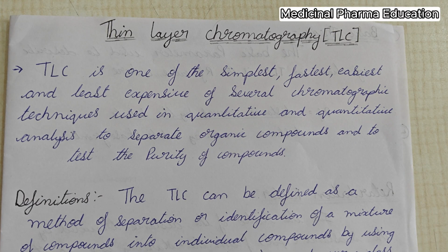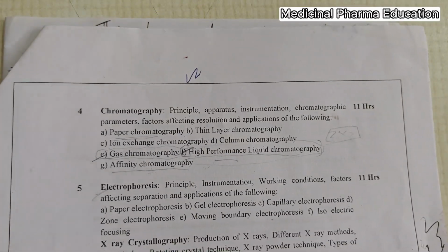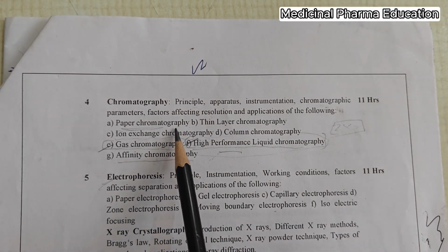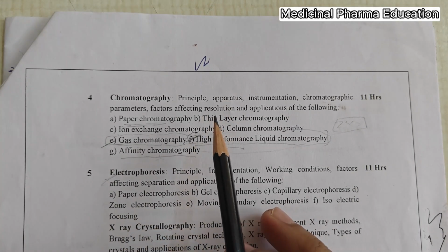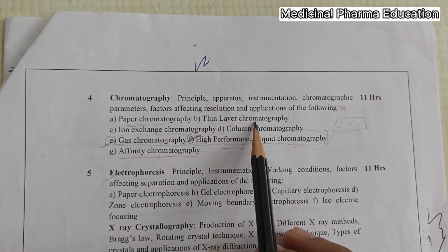In the previous class, we discussed paper chromatography completely. If you have not watched it, go and watch it. In today's class, we are going to start with thin layer chromatography.